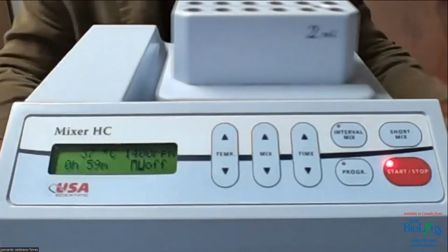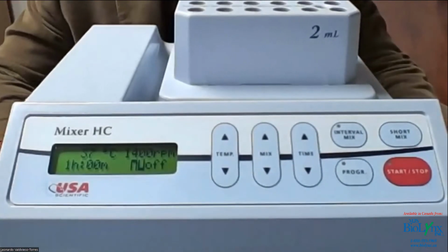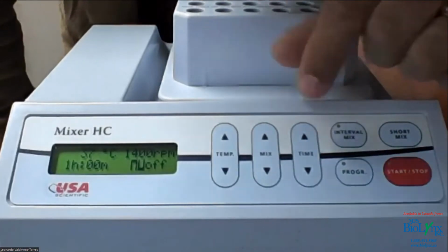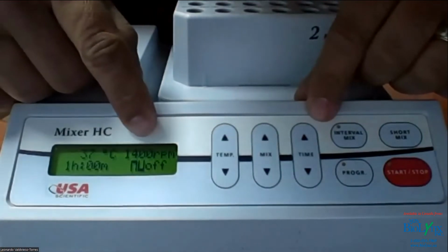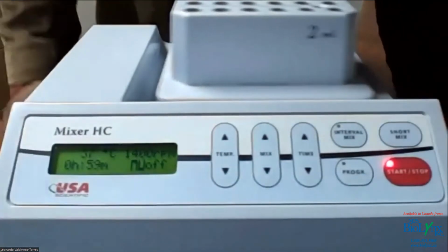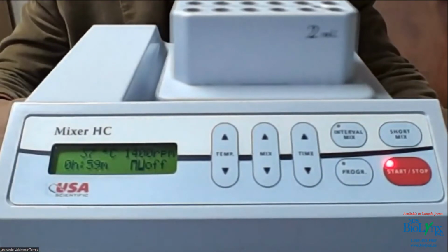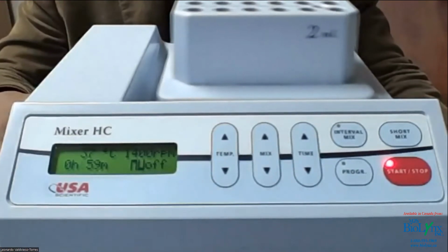Awesome. Thanks, Margaret. Next question from Catherine. Is it possible to set up a constant mixing? Absolutely. Constant mixing. Yes, that's exactly what we did. So right now it's set up at 1400 RPM. It's at 1 hour for 37 degrees Celsius. You can actually click start and we go for 1 hour mixing. So it will mix for an entire hour. And that's without even using the two-step programming function. There you go. All right, thank you.